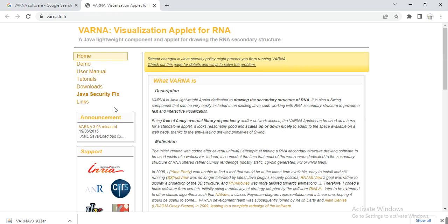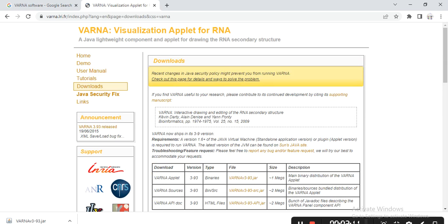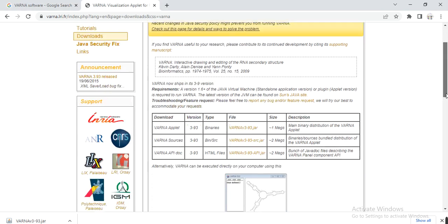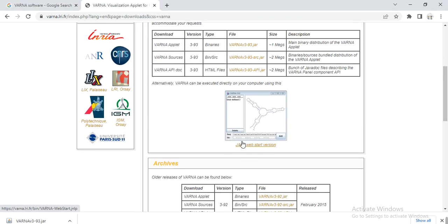It guides us to the window. Here you select the Download option. These are their applications — you can use the VARNA applet or any other. You can also use the Java Web Start version.